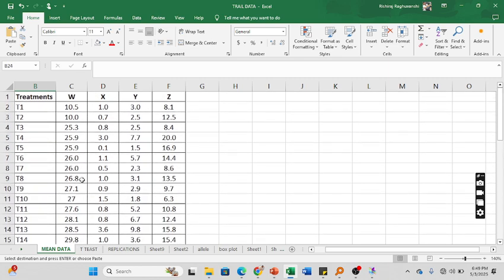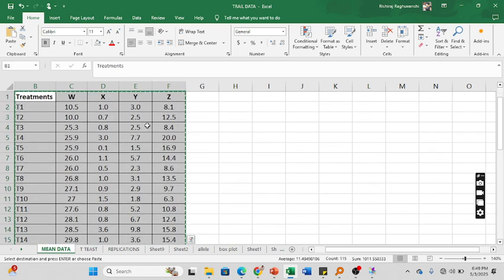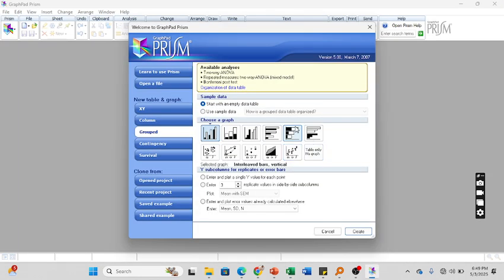So what kind of test can we apply to this kind of data? First, if we are interested in a box plot or bar plot, we can see which trait or variable is showing an increase or decrease, or analyze the diversity. So we'll just start from the basics. I've copied this here, and now this is GraphPad Prism.